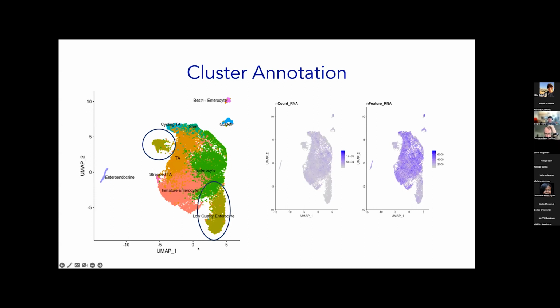So in this one, I should have discarded these cells in the QC, because they are not healthy cells. They were not well detected cells, but an artifact of the processing of the sample. If I wasn't careful with this, I might mistake this for a real cell type, and this would be very problematic because I may be inferring biological insights from something that was just a technical problem.